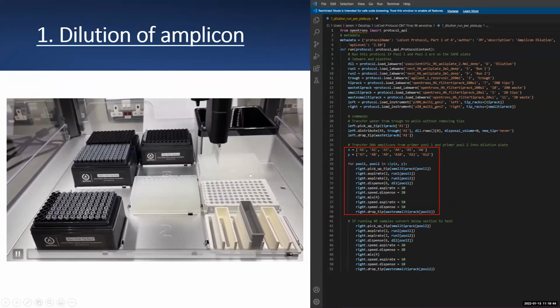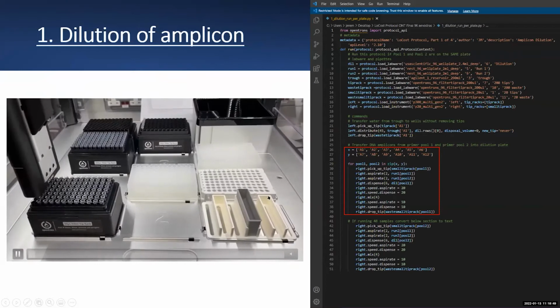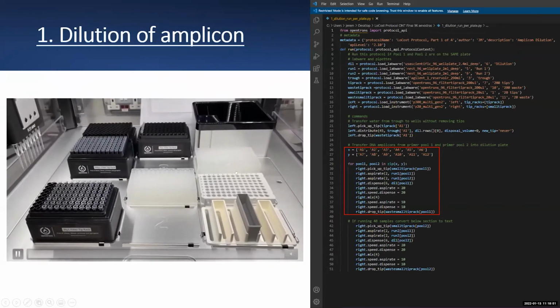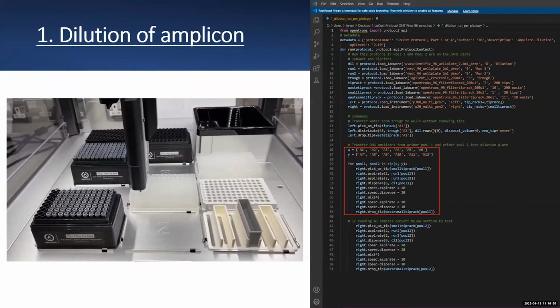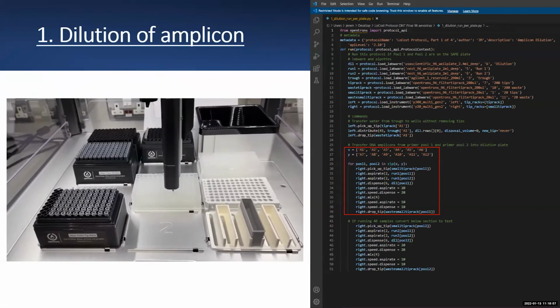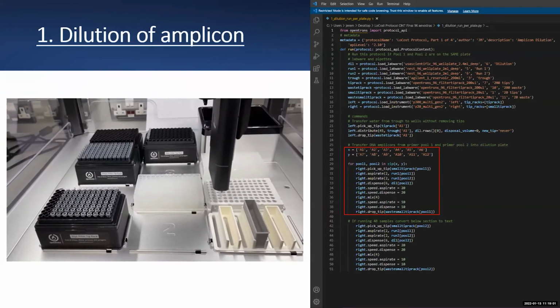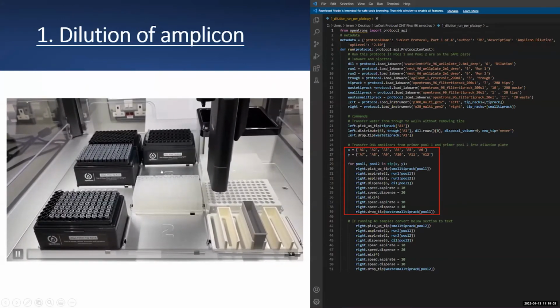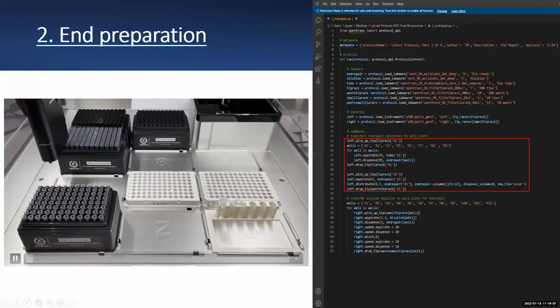One of the other nice things is that because of the open source nature of OpenTrons, we're able to use a lot of custom labware designs, including this glorious plastic tat that I have here. And with that, we're able to basically customize and modify the robot to fit each lab that we're hoping to work with. We've done this a lot with our Brazilian collaborators as well.